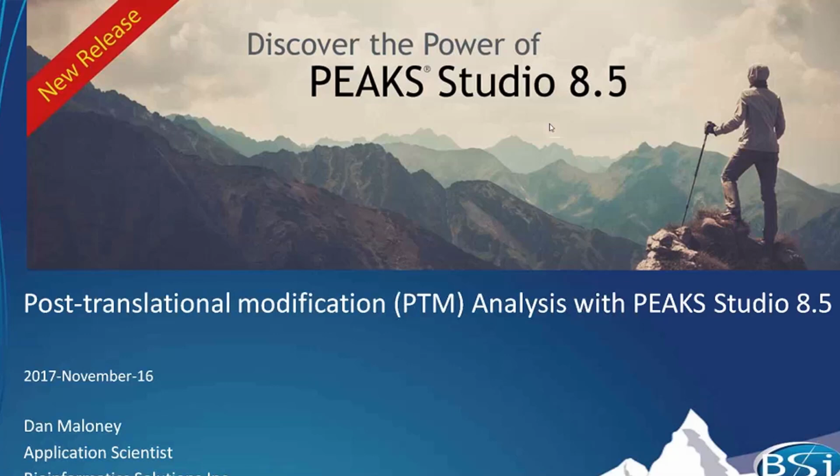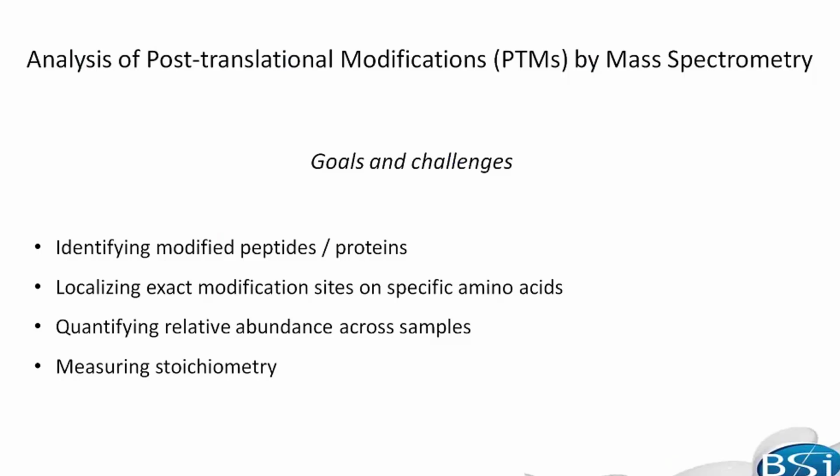So the webinar that we're going to be going over is related to Post-Translational Modification Analysis with PEAKS Studio 8.5. All right, so I'm going to start off the presentation talking about a little bit of the goals and challenges of analyzing PTMs with mass spectrometry.